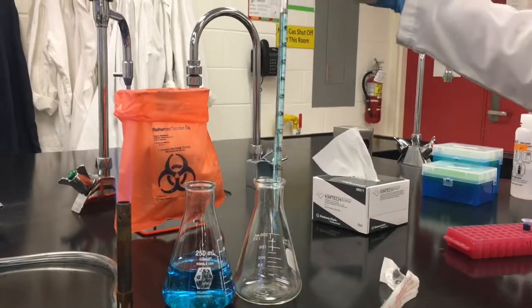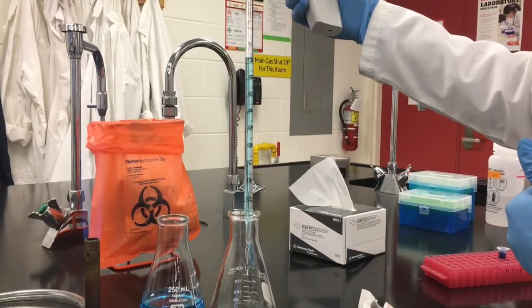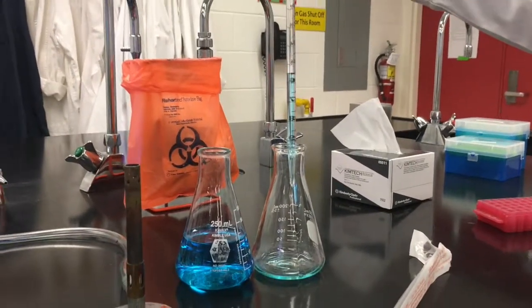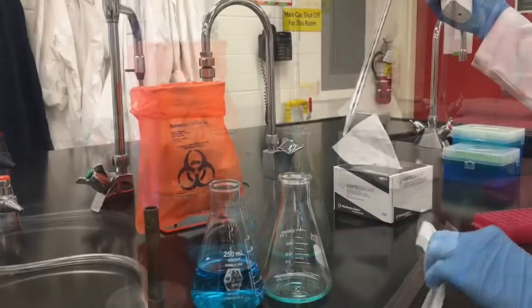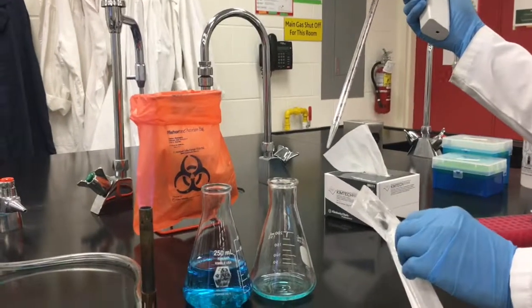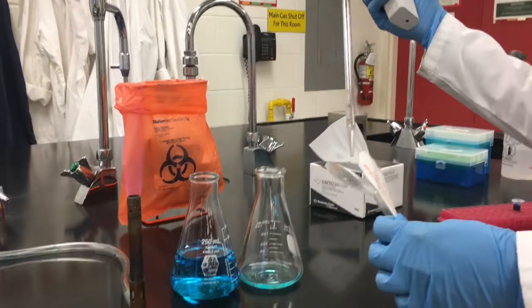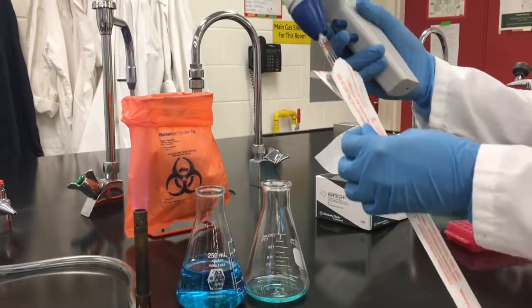Carefully transfer the tip into your receptacle. Dispense the liquid down the side of the container to avoid splashes. Replace the sleeve over the pipette tip for safe disposal. This prevents puncturing the garbage bag or biohazard bag that it is placed into.